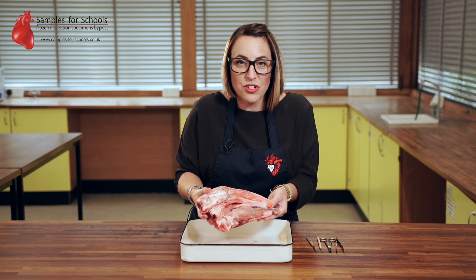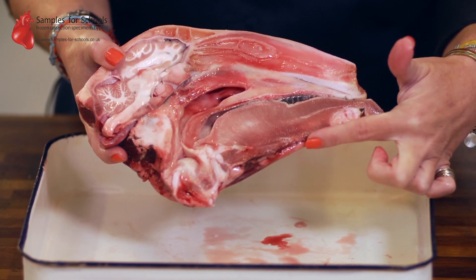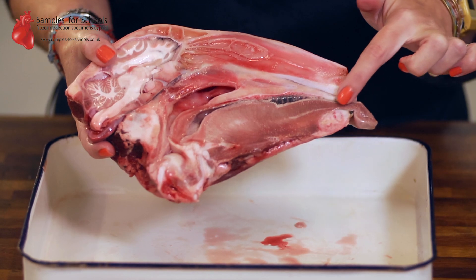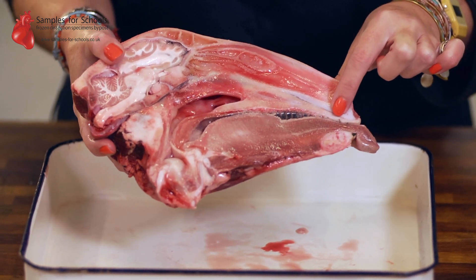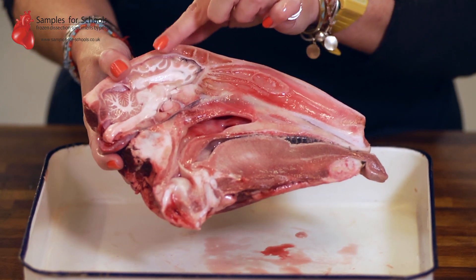When we look at the back section of our sample we get a really good cross-section of all the different structures and tissues that you'd find. You'll be able to identify this really thick muscle in the tongue, the strong mandible jawbone that's going to be used for chewing the cud, as well as the sinus cavity and the brain.